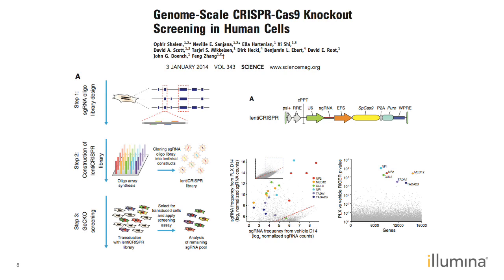In addition to the GeCKO library, though, there are also a few other groups who have developed libraries of their own as well, including the Toronto Knockout Library and the Brunello libraries, also from the Broad.